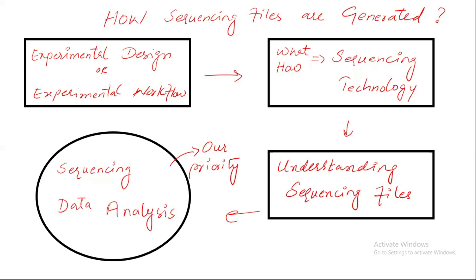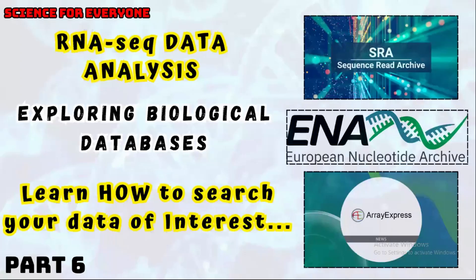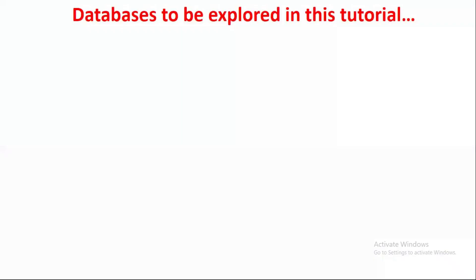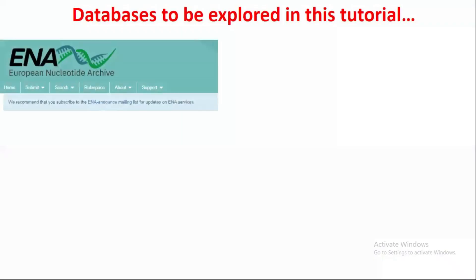Now I'm going to proceed with the data analysis, but first we should know how to get or choose your data of interest. For that, there are multiple databases where sequencing files are stored and you can retrieve them easily. In this tutorial, I will discuss the European Nucleotide Archive (ENA) database, where sequencing files are present, and show you how to explore it and choose your data of interest.